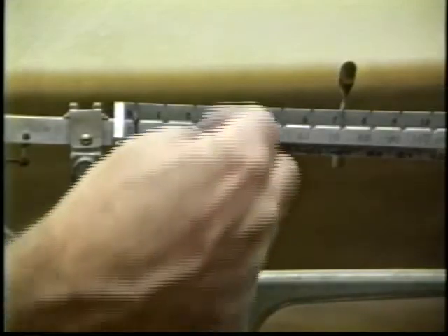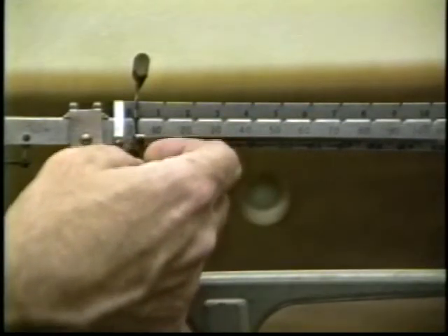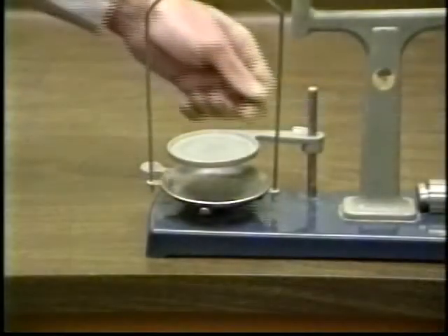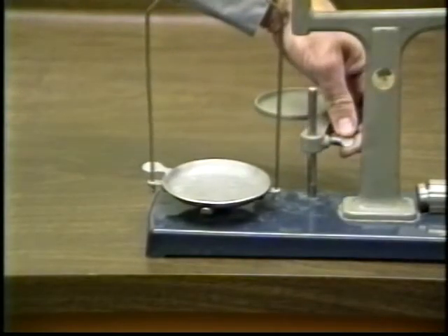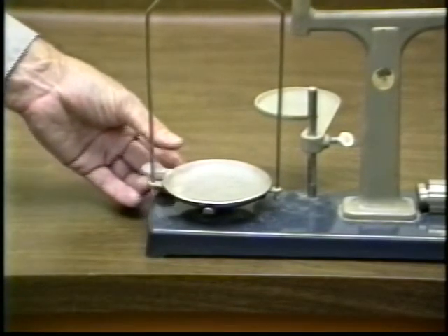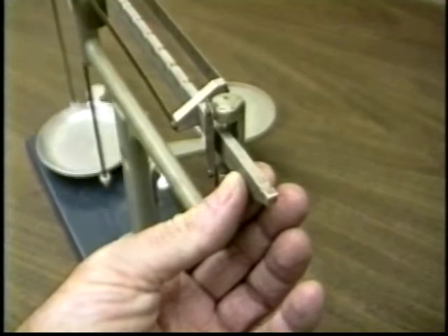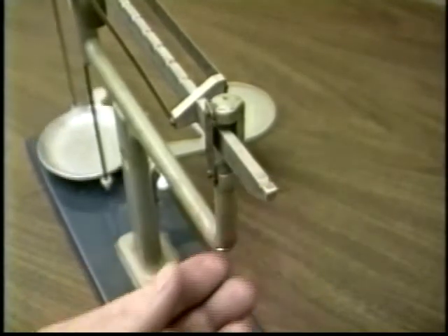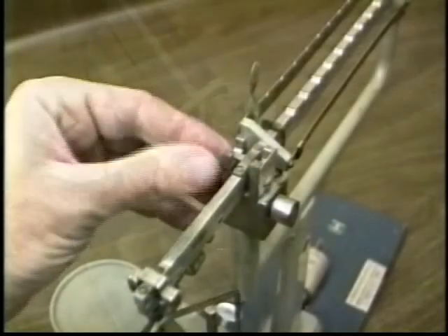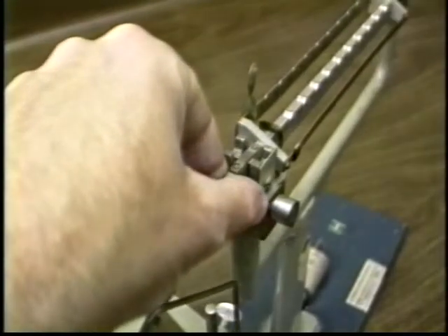Move the three sliding masses back to their zero positions. Swing the support stand out of the way of the balance pan. Make sure that the beam doesn't scrape against the side supports — check this often while using the balance. Also make sure there is no rubbing at the pivot point. Center the beam in its holder at the pivot point.